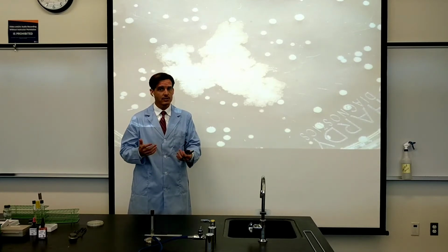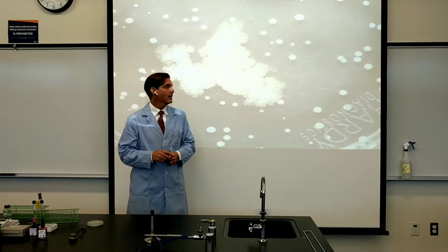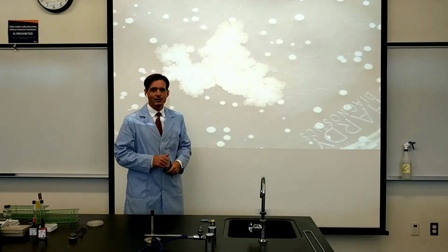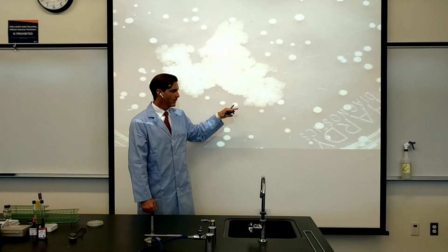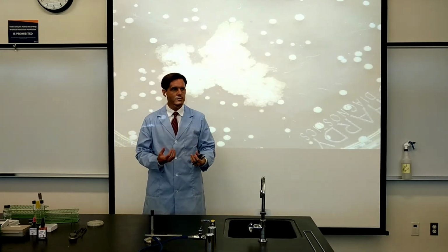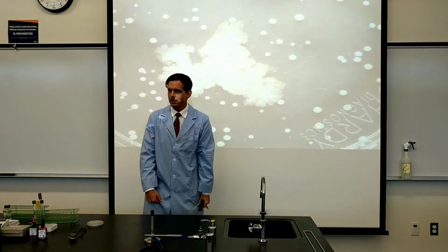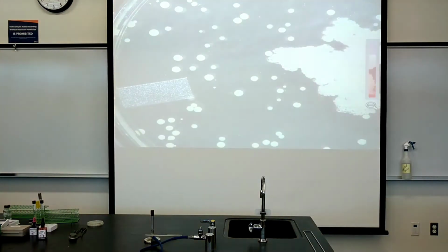We have some fungi as normal flora as well, just not nearly as many as the bacteria. So maybe I have some Trichoderma on my skin. But the only way I would be able to identify these more certainly would be to put them under a microscope and actually look at their structures. We're going to do that later in the course. For now, though, we're just taking a broad look at this.